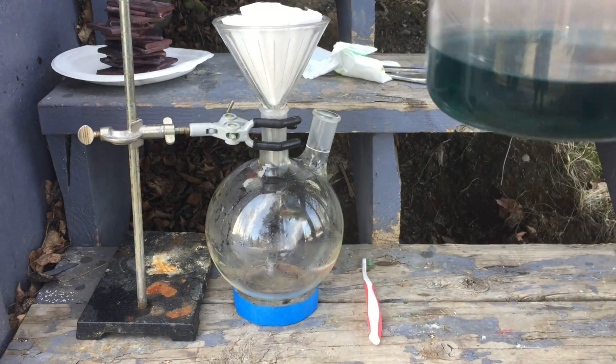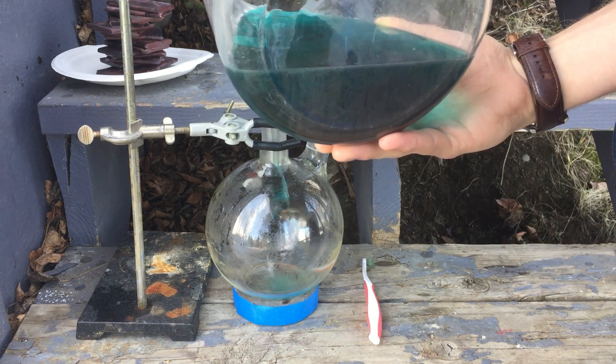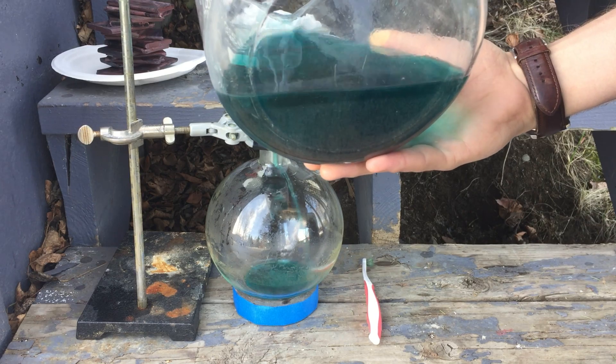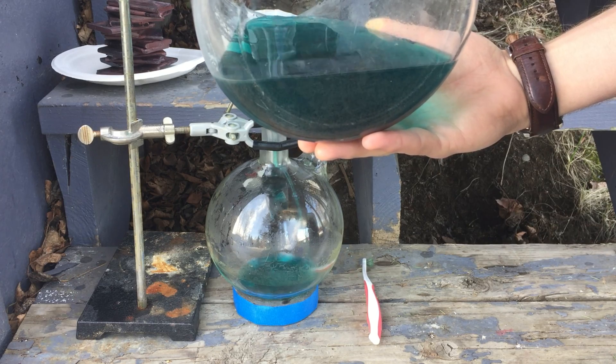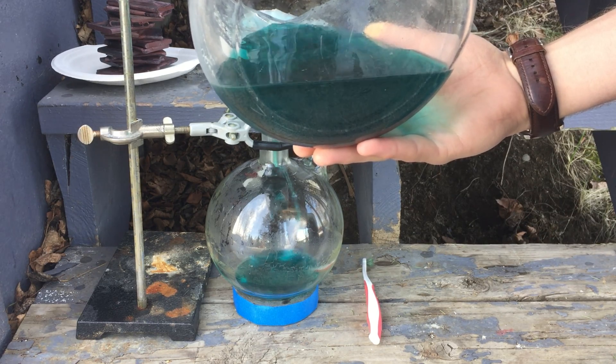After the washing, the precipitate was allowed to settle on the bottom of the beaker. Everything was then passed through a few layers of coffee filters leaving the silver trapped inside. I was initially worried that I would lose a lot of the precipitate through the relatively large holes in the coffee paper, however it ended up working just fine.